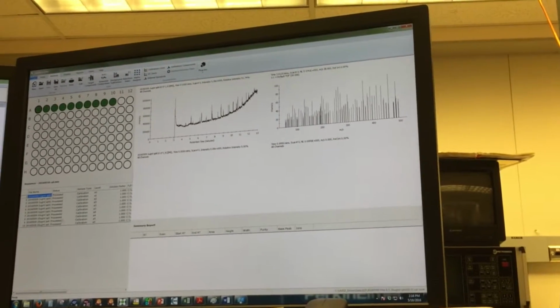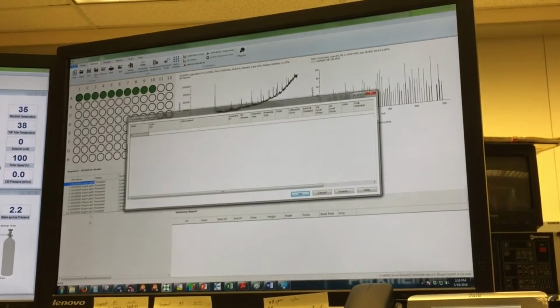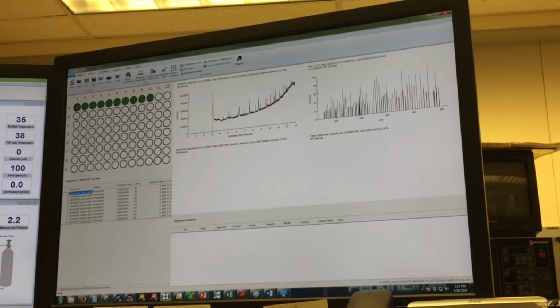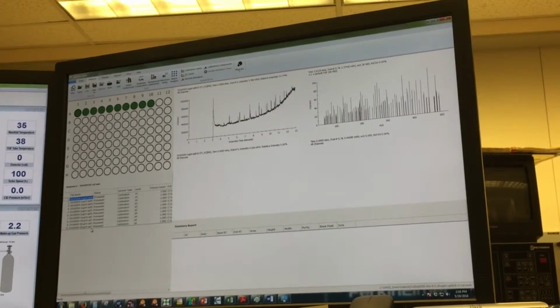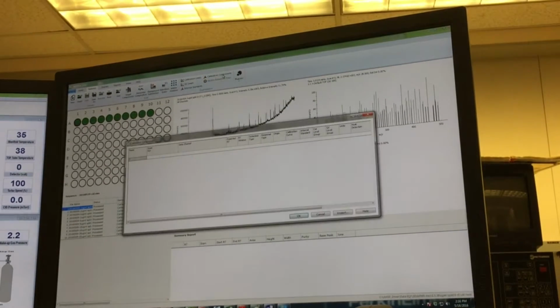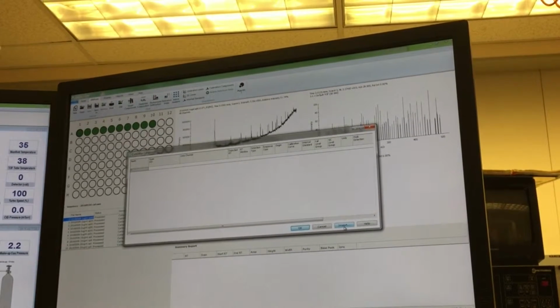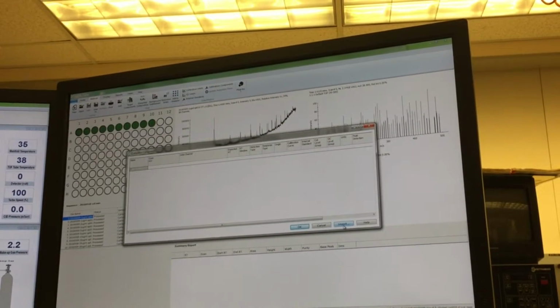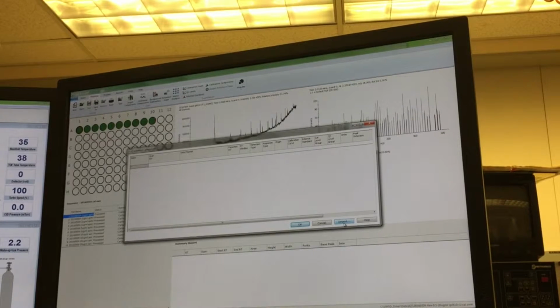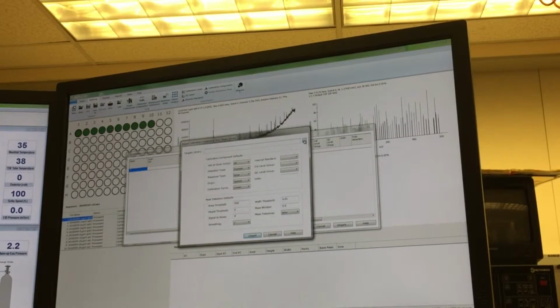Done, you label. Then after this you have to click on calibration component. After finishing this step, you write the sample type and level, then you go to calibration component. Here you have to import, I told you, you need a target library for your sample analyzing, so you can import your target library here. Click.